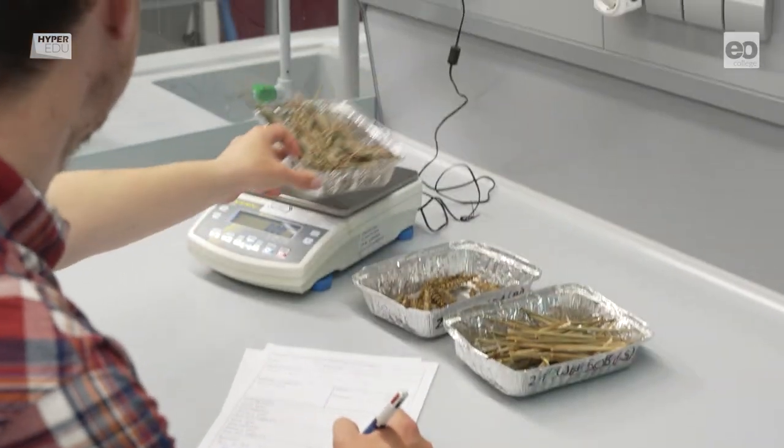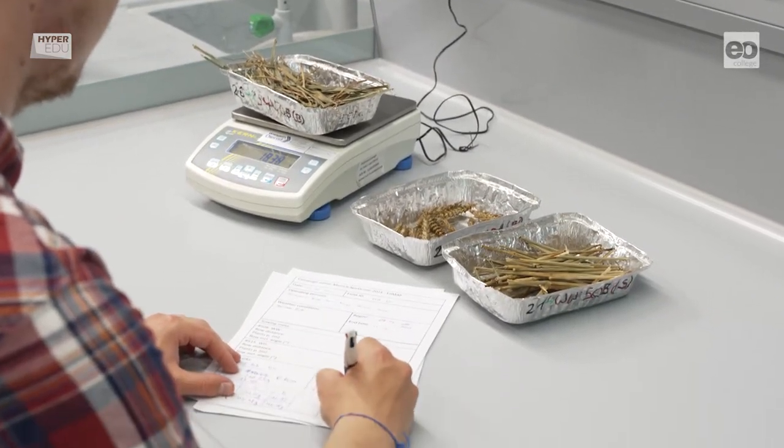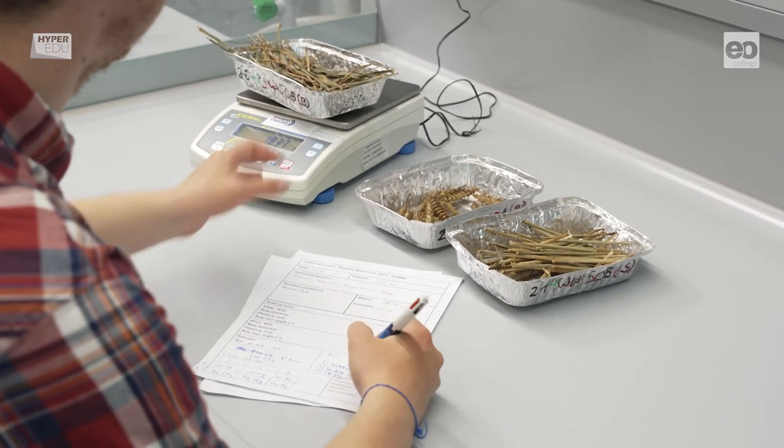And because Benedict separated the plants into ears, leaves, and stems, we now know the average water content of the individual plant constituents.